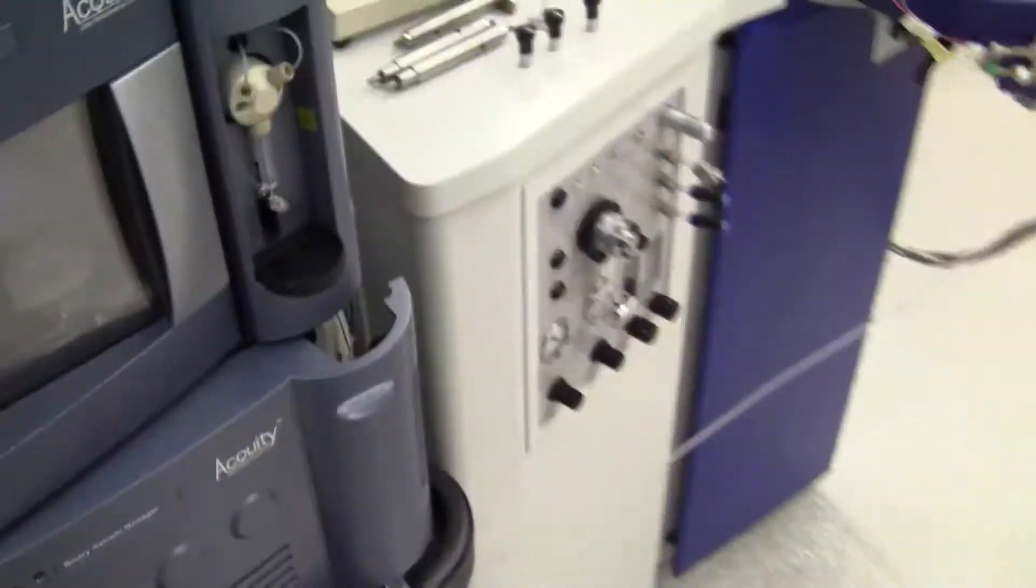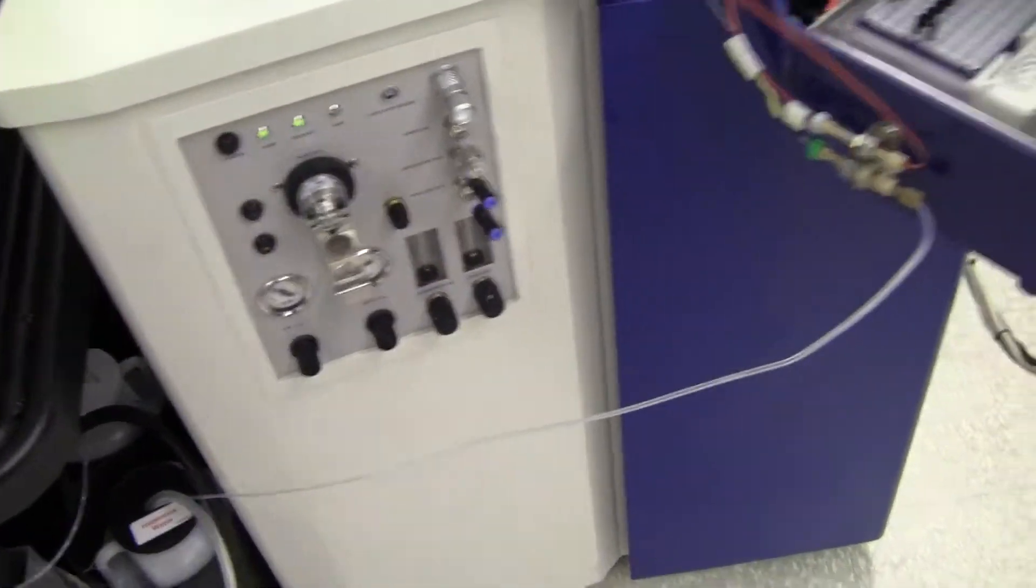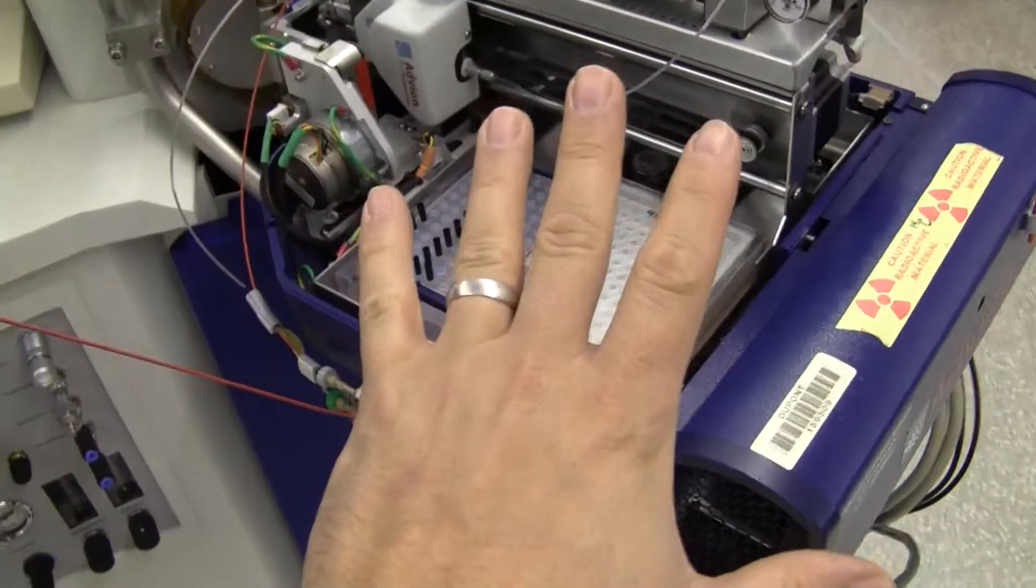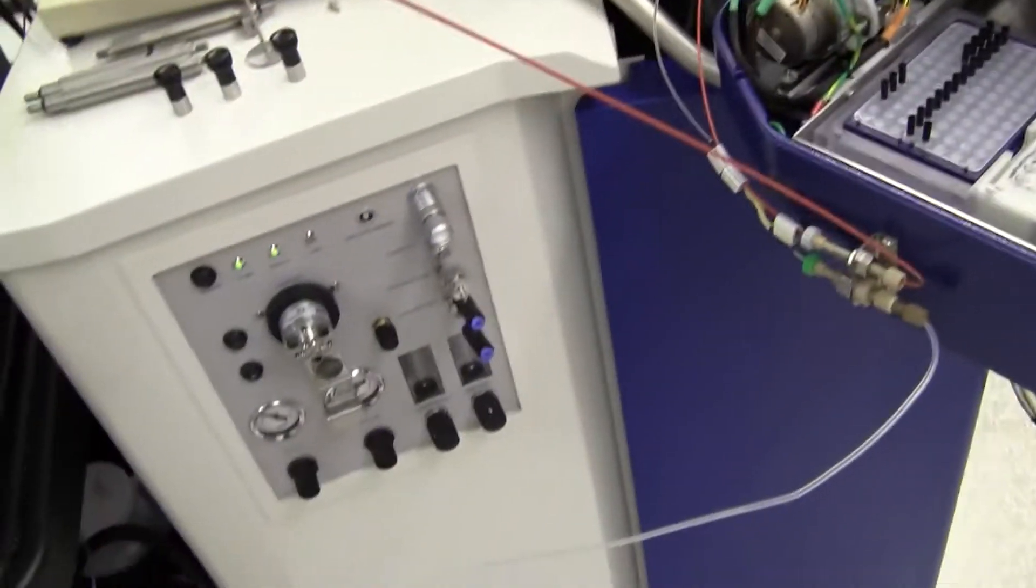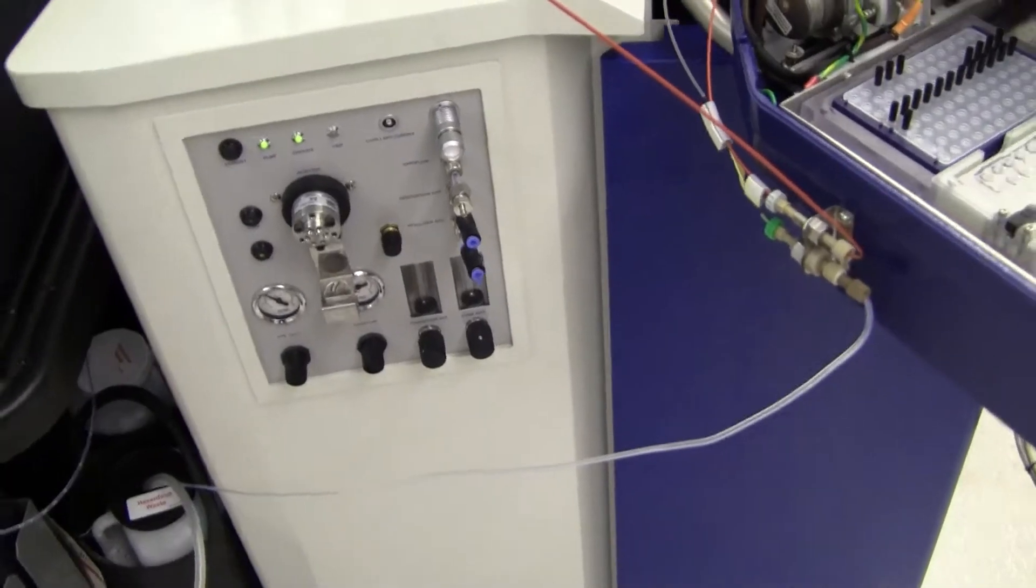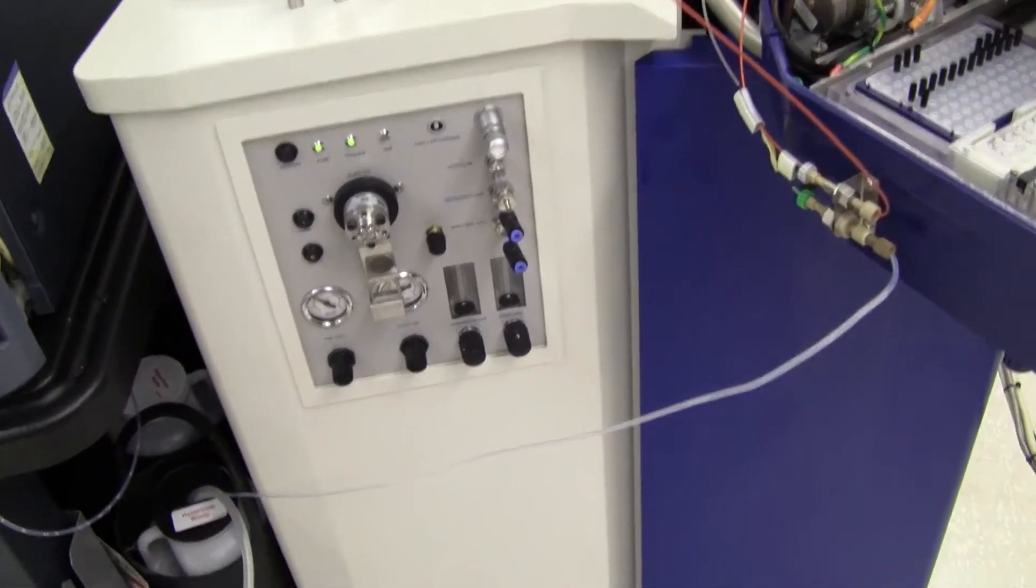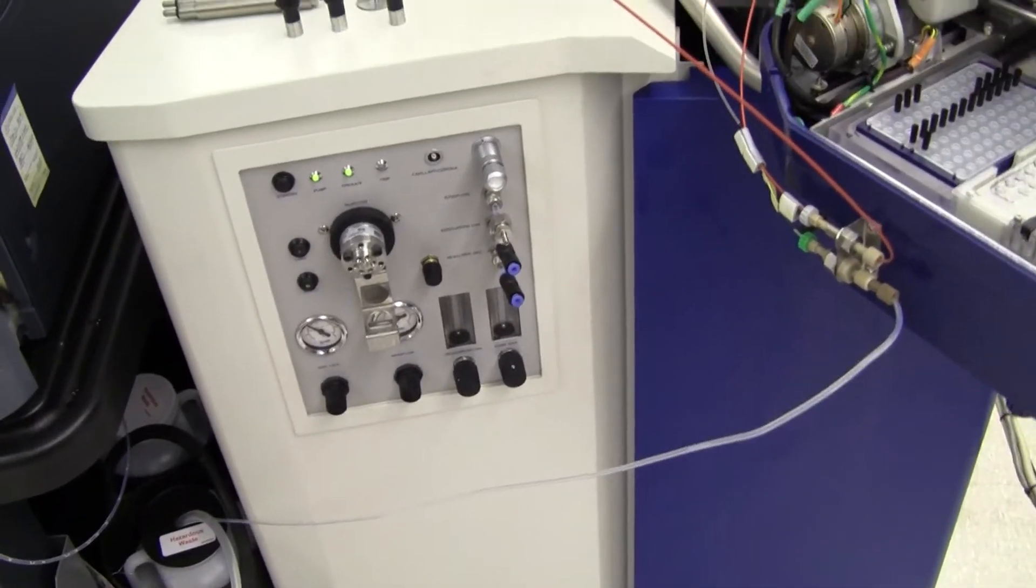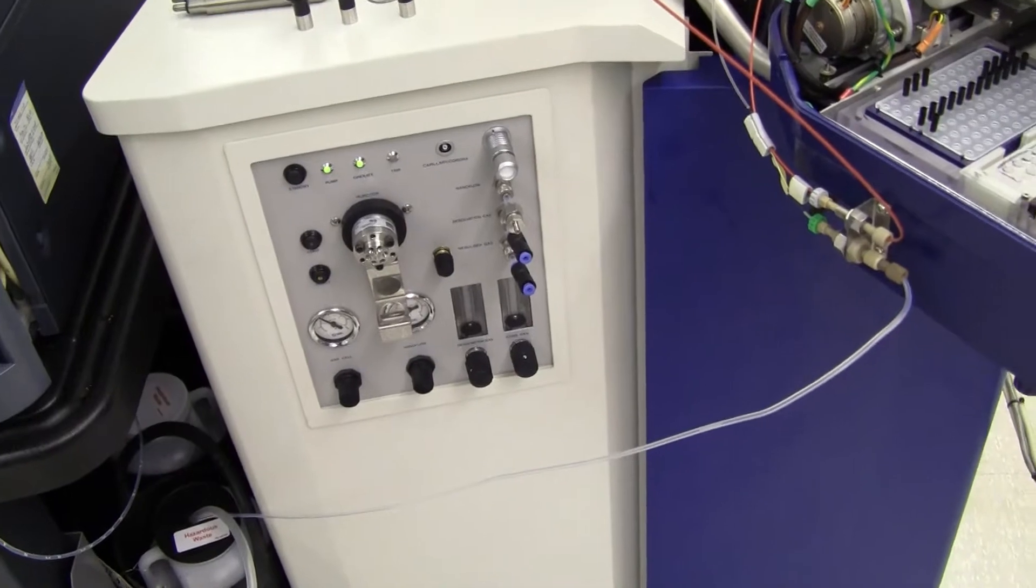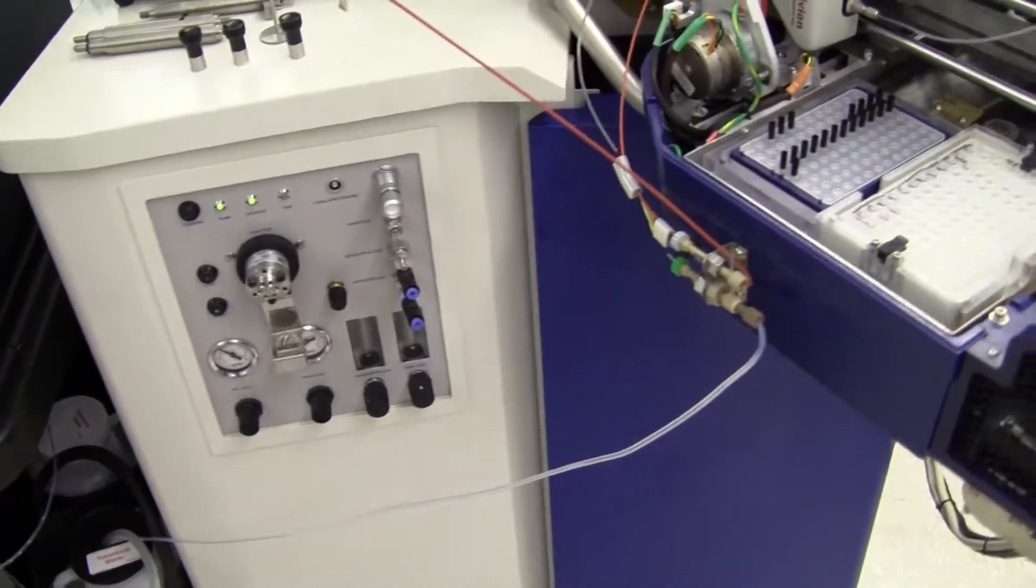Excluded from this unit is the HPLC system, the sprayer, and the controller. It is just the Micromass itself. It does come with the computer. You have to reload the software at the time of installation.